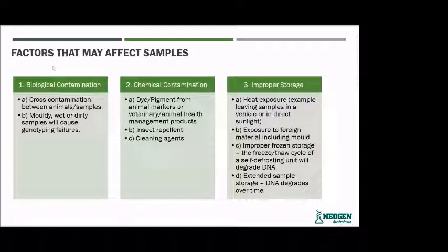The second factor is chemical contamination. Any dyes or drenches that you may put on your animals, or cleaning reagents on the tissue, can interfere with the lab process. Improper storage also impacts the quality of the sample — any exposure to heat, leaving it in the vehicle, or in direct sunlight can deteriorate the quality of the sample.